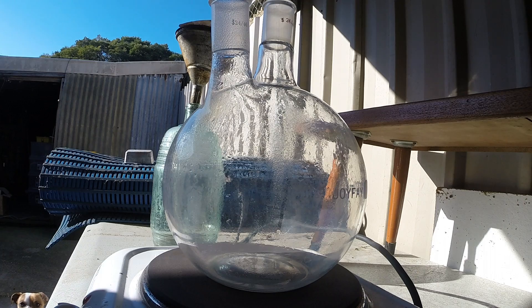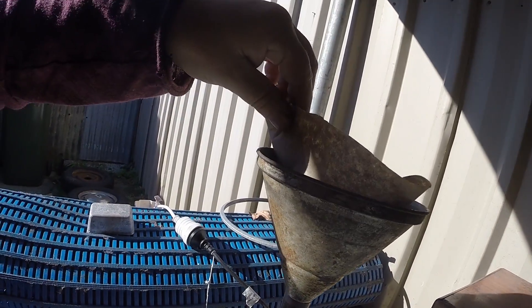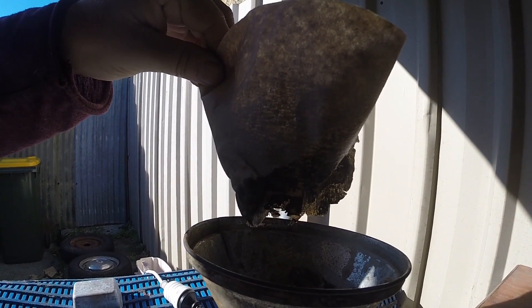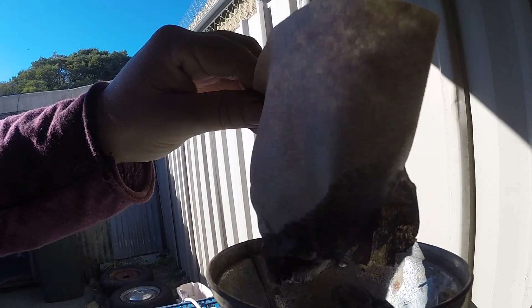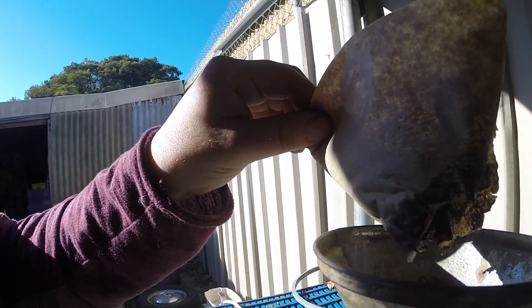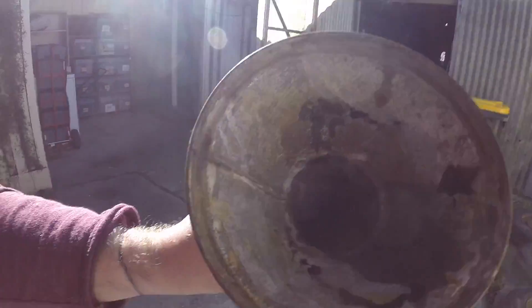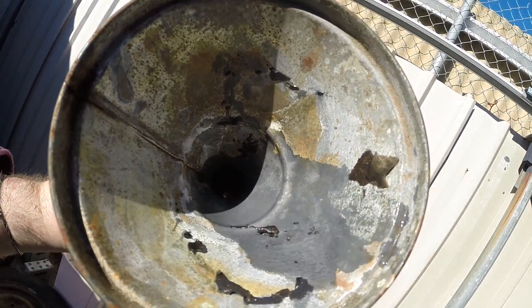Okay, it's our first batch. I'll show you what it just did to this filter. It's definitely having an acidic effect on the metal funnel as well. Look at that — it's nice and clean.